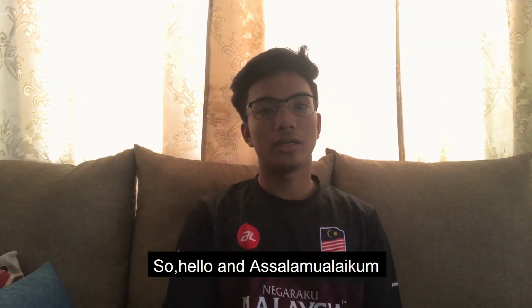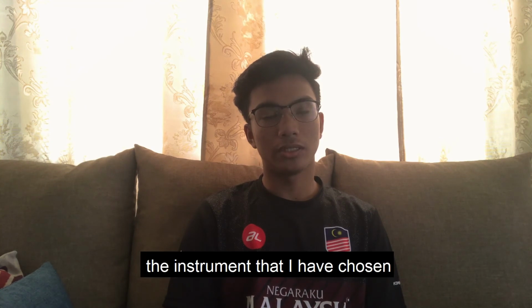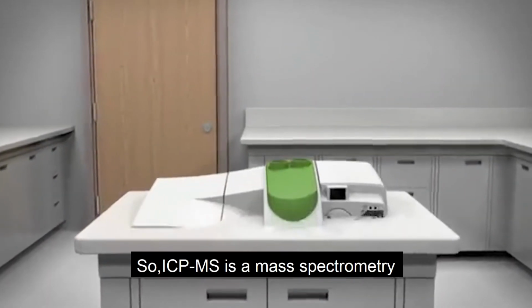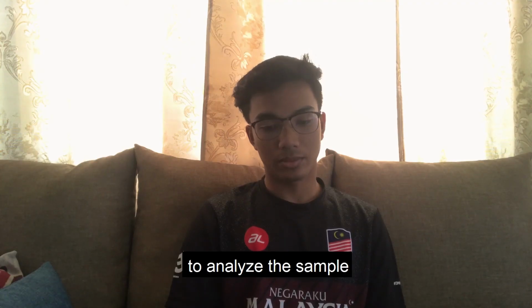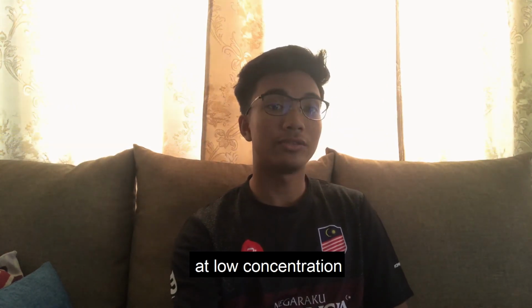Hello and assalamualaikum. My name is Muhammad Nazrin, and today I want to talk about the instrument that I've chosen to trace pollution, which is ICP-MS. ICP-MS is a mass spectrometry that uses an inductively coupled plasma to analyze the sample. It can trace heavy metal pollution at low concentration.